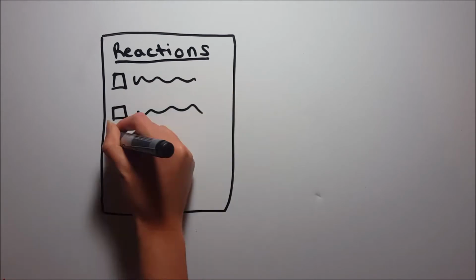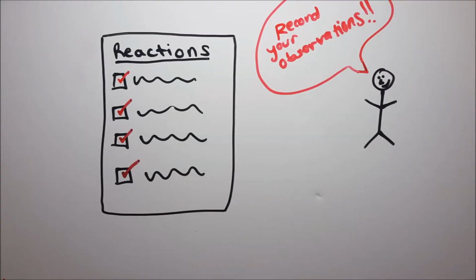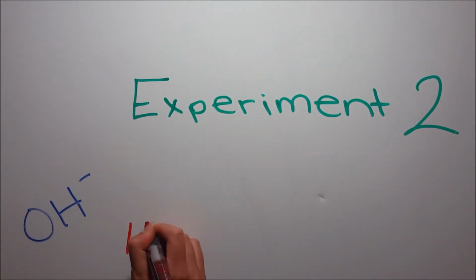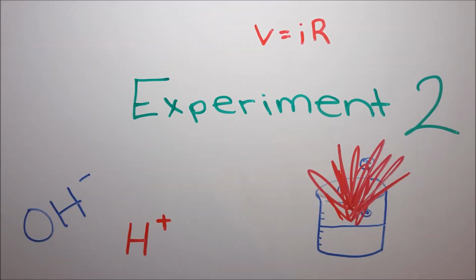The Chemical and Periodic Properties lab typically involves students going through many different reactions and recording their observations. At a certain university, you might be asked to do things like test substances for their acidic or basic properties, measure the conductivity of substances, or even watch highly reactive alkali metals like sodium or potassium interact with water.